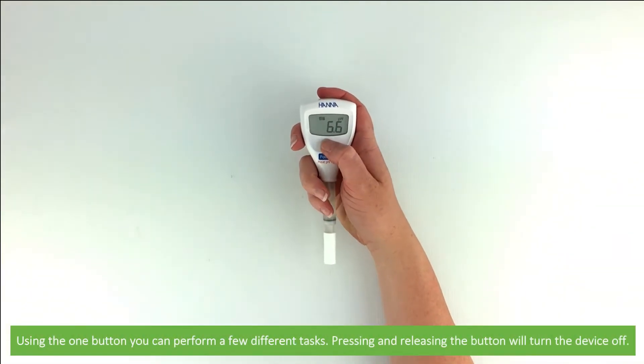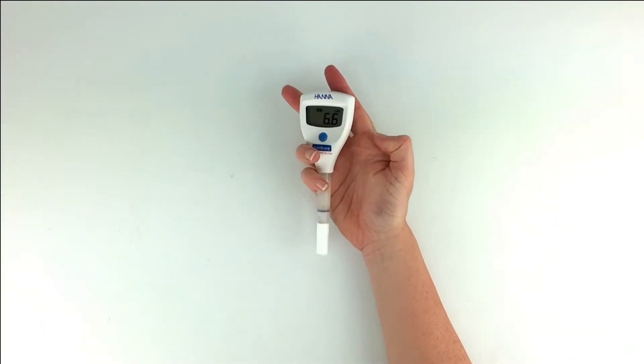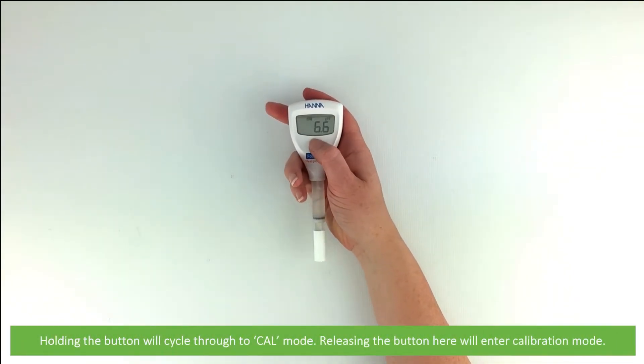Using the one button you can perform a few different tasks. Pressing and releasing the button will turn the device off. Holding the button down will cycle through to calibration mode. Releasing the button here will enter calibration mode.